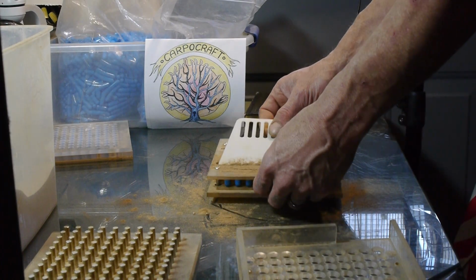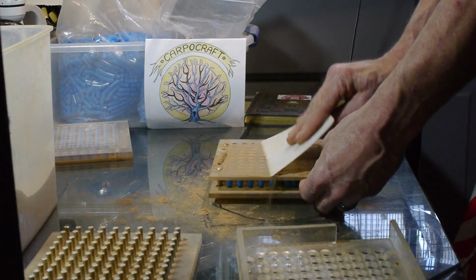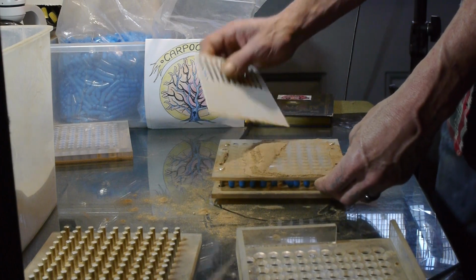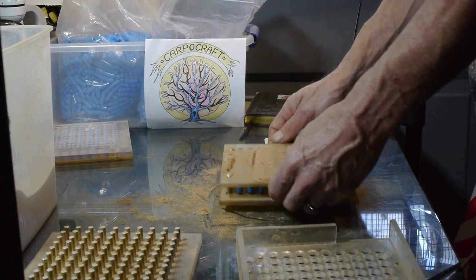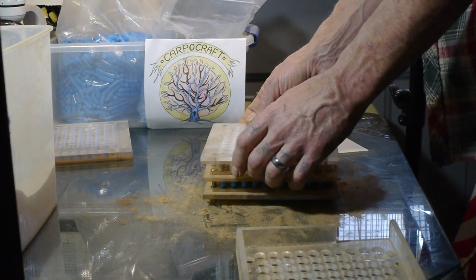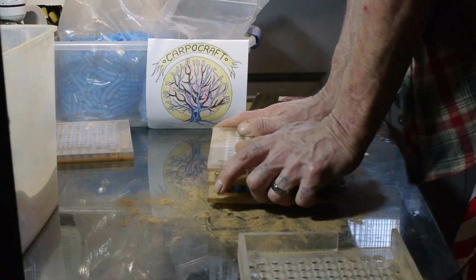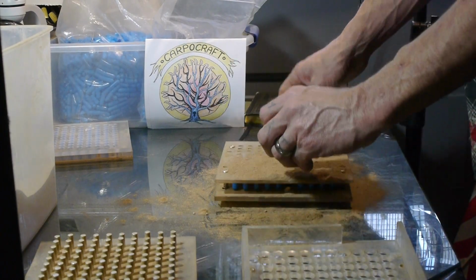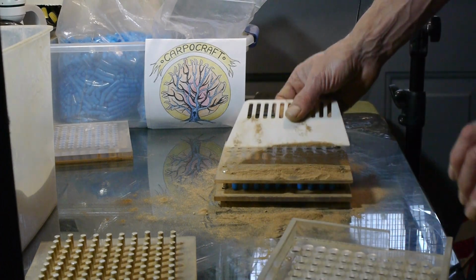So now that I have them all on there, I just use this tamper to slide over the holes and pack it down as much as I possibly can. And then I might even use the tamper one more time just to make sure. I want every capsule to be even. See, that one keeps falling out. Good enough, it's full.